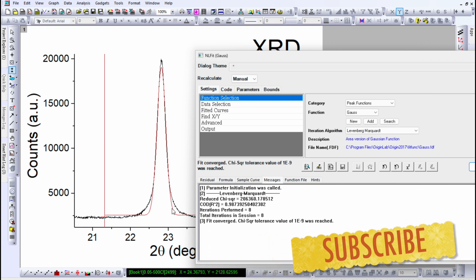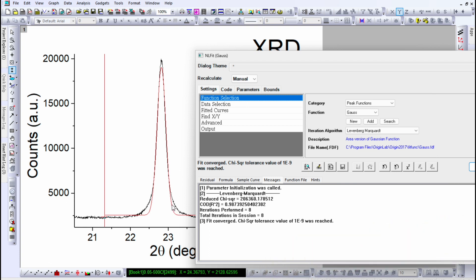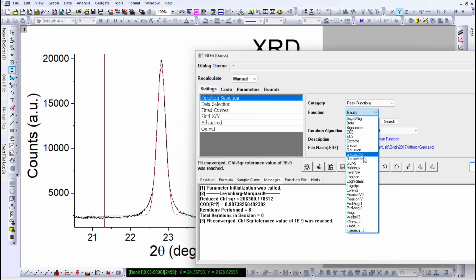Here you can see that the red line at the bottom is not matching well with the experimental data, so this fitting doesn't look very good. To know whether the fitting is good or bad, look at the COD R-squared number, which is 0.987. This is pretty low because if this number is close to 1, it means your fitting is excellent. So go back to function selection and choose the Lorentzian function instead of Gaussian.